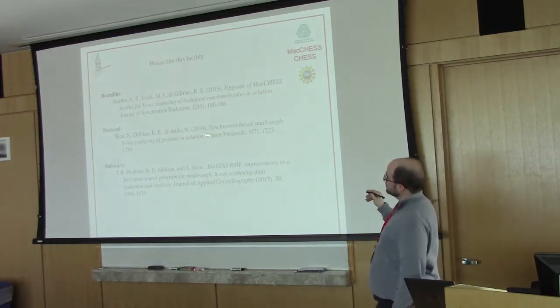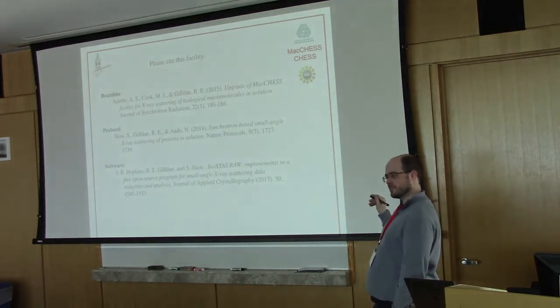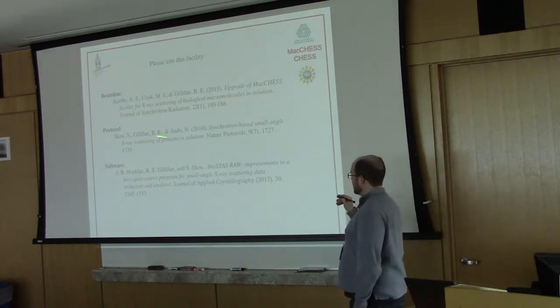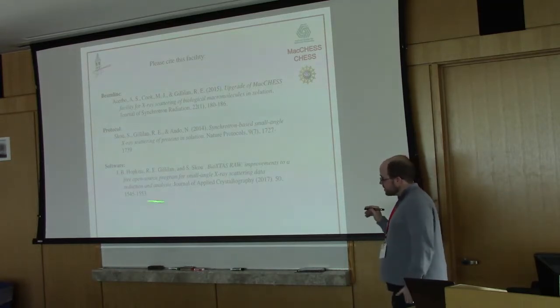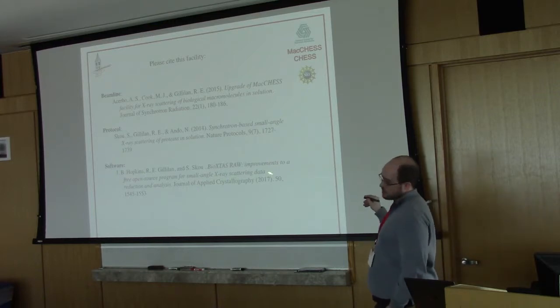This is a protocol paper that you may find useful. I believe someone earlier today showed, maybe Kushal, a list that included this protocol paper on how to carry out standard synchrotron experiments with small angle X-ray scattering. And if you open up RAW, it'll pop up a screen with this citation. It's not in your slide, I believe. But this is the most recent paper we've published on the data analysis software.